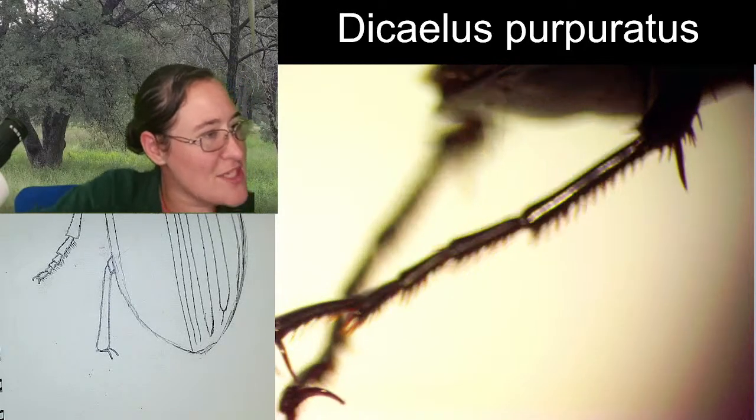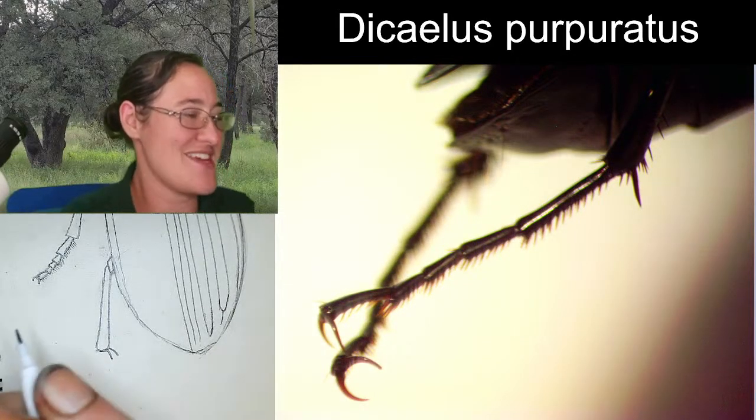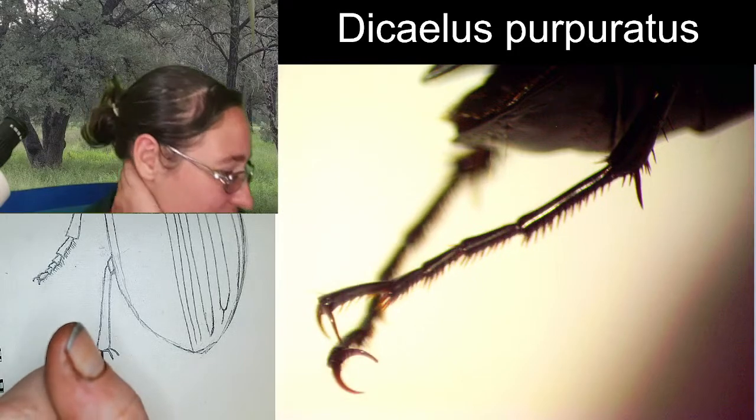Tarsal segments for your viewing pleasure. They are beautiful and long and thin and covered with these crazy bristles that help them run. The first tarsal segment's fairly thin and long. Let's see.